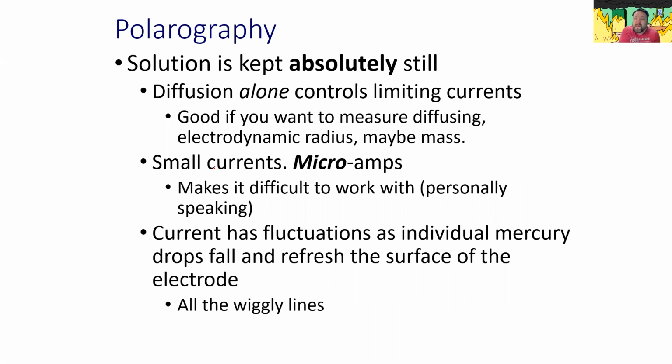We're going to get very, very small currents out of this. So we're talking like microamps. Right? So you need some pretty sensitive equipment to do this. It makes it hard to work with. So I've tried to do this, and it was not a good day in the lab, or a good couple of days in the lab.